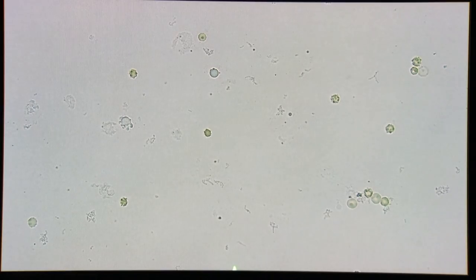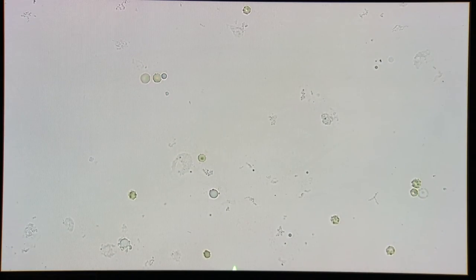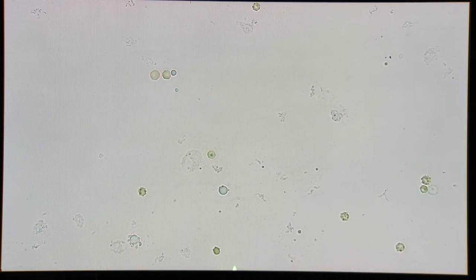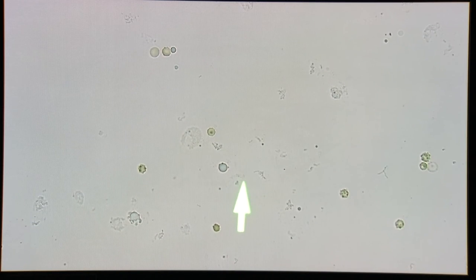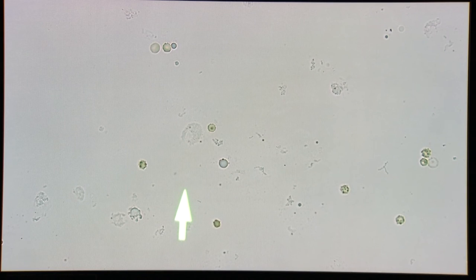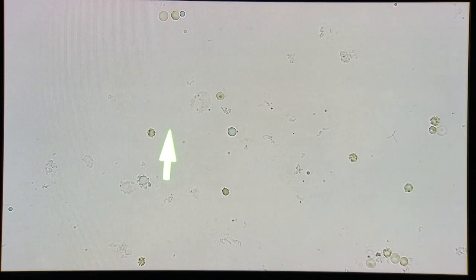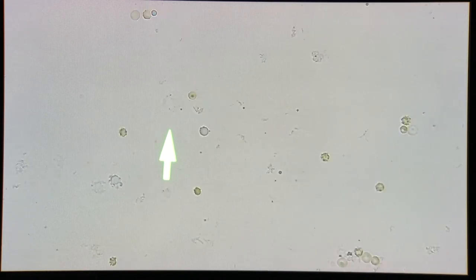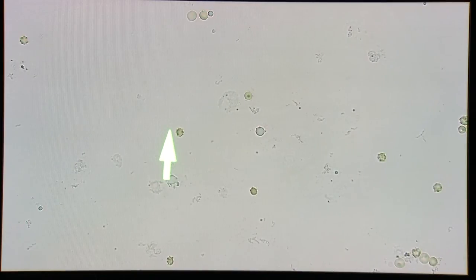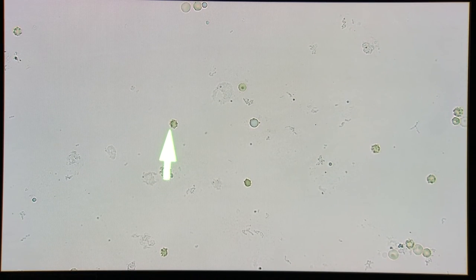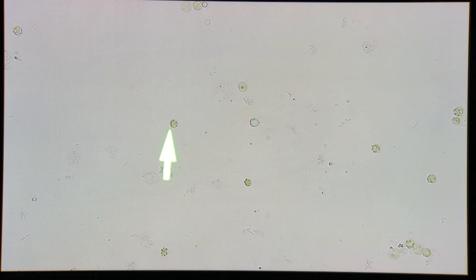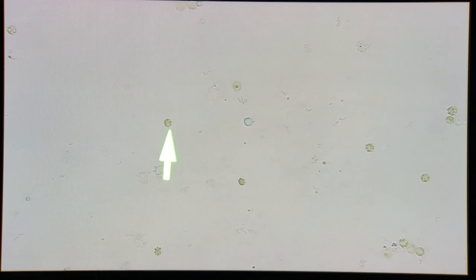Today in this urine, we have some cells to show you. These are red blood cells here. That's a red blood cell. Just up a little ways here, this is an epithelial cell.